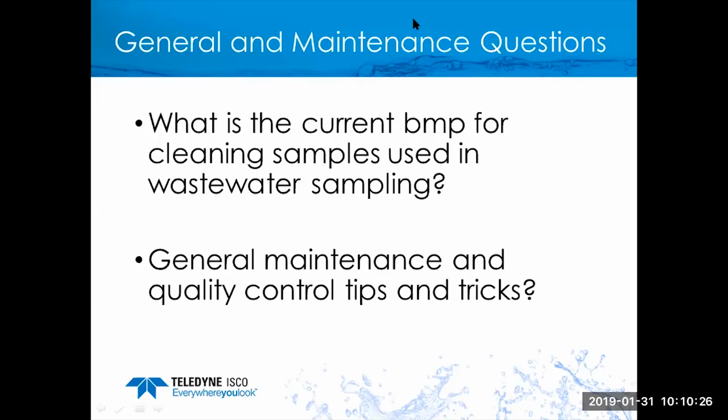Periodically inspect the case humidity indicator on the sampler controllers to determine if the internal case humidity is elevating. This would indicate the need to recharge or better yet, change the internal desiccant packages. Use your senses. If something sounds abnormal, something probably is abnormal. Don't walk away and expect trouble-free performance if you have abnormal noises coming from your equipment. Use your visual senses. Does something look incorrect? Does something look wrong? These are signs that there might be needs for some more elevated maintenance.